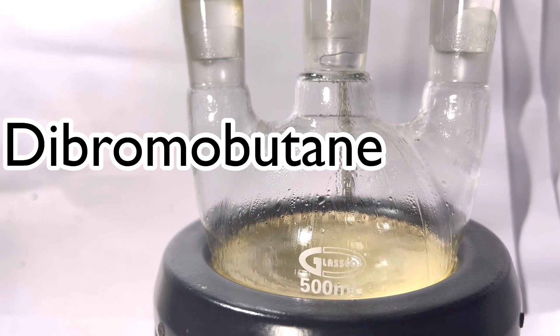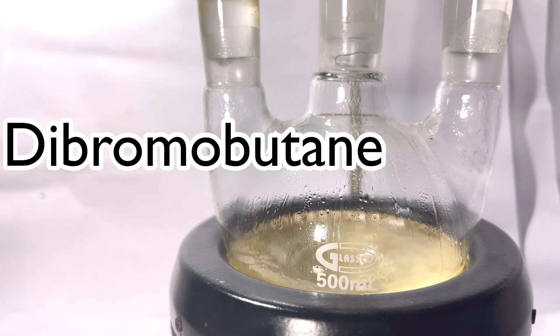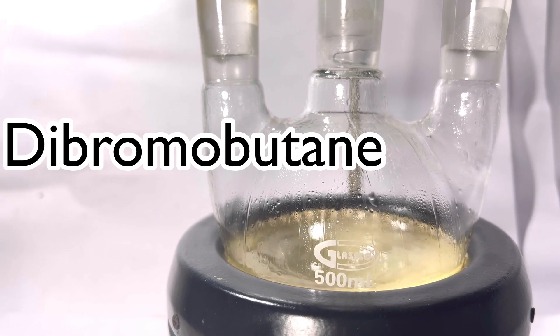Hello friends, in this video we will synthesize 1,4-dibromobutane from tetrahydrofuran.